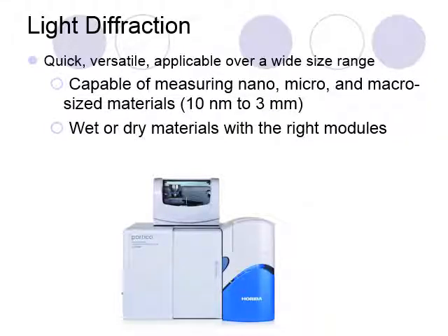So this will be the bulk of the rest of the talk, and this is the technique that I use at H&M, a technique I used a lot in graduate school. It's the equipment that you guys would probably have the easiest access to at this point to get up and running to take these measurements for your work. Light diffraction is quicker than most of these other techniques. It's versatile. It also applies over a very wide range.